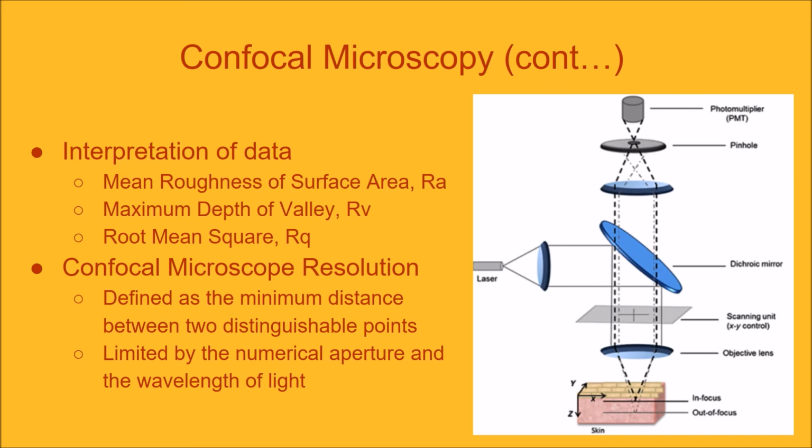In short, the confocal laser scanning microscope is like a conventional optical microscope with a laser beam. CLSM works by passing a laser beam through an aperture and then focusing the beam with an objective lens onto a targeted area of the sample. The laser scans across the sample, and the in-focus areas of the sample are collected into the photomultiplier tube. Through vertical optical sectioning, the entirety of the image is eventually brought into focus and added to the resulting image.